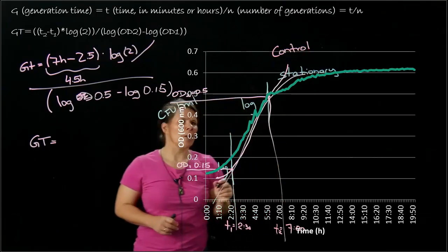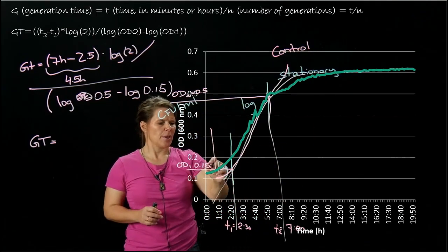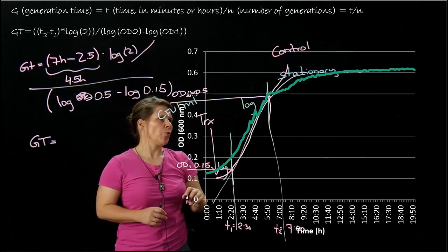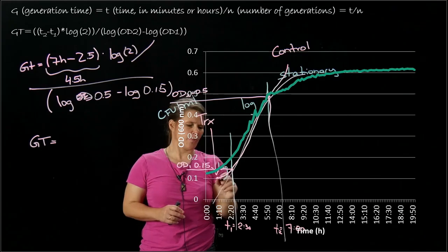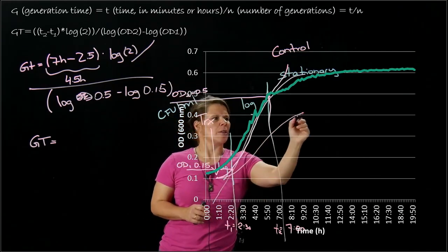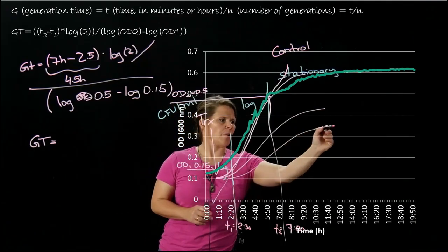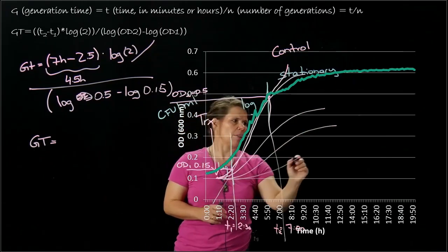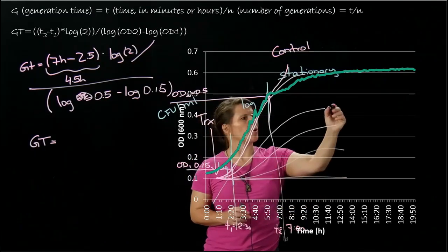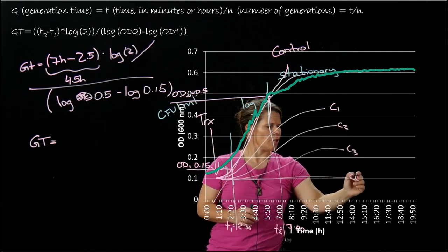So you have pretty advanced growth of the organisms. For example, if you would now add your treatment at time 0 to a different well of your spectrophotometer, you could probably determine that your growth changes over time. And if you have different concentrations of your antibiotic, you probably see something like this. That would be concentration 1, concentration 2, concentration 3, concentration 4.